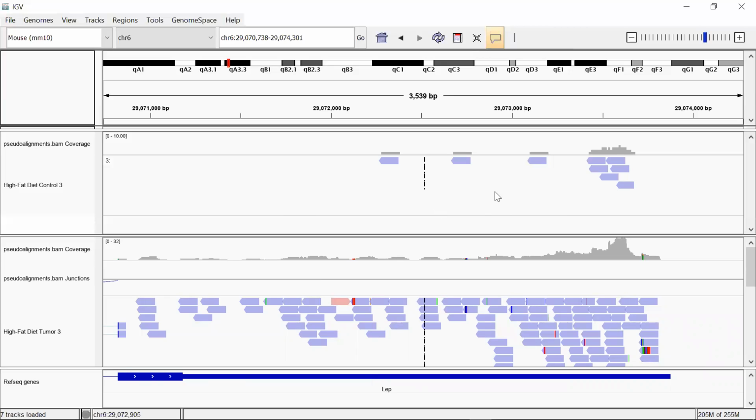And then we visualized what differential expression essentially looks like in the IGV. And of course, in order to make this something much more useful, we'll run a program to determine the significance of differential expression at all the genes or across the genome. And that's what we're going to do next.